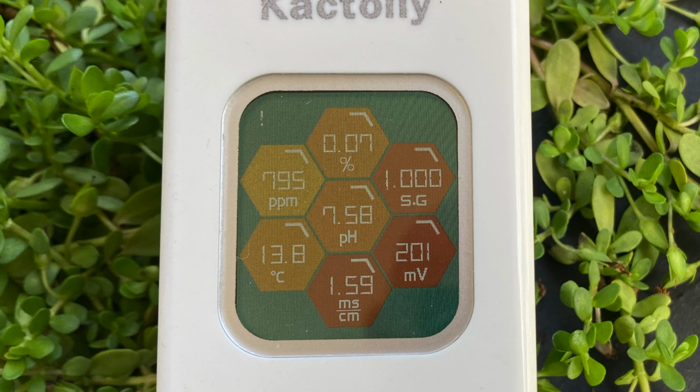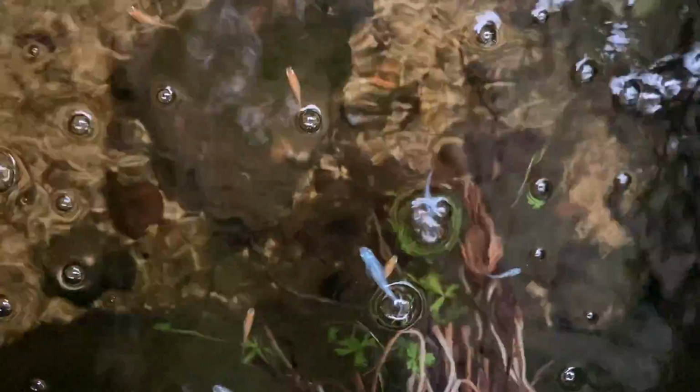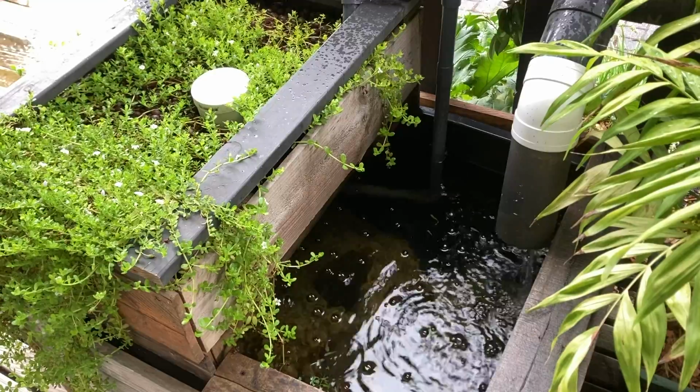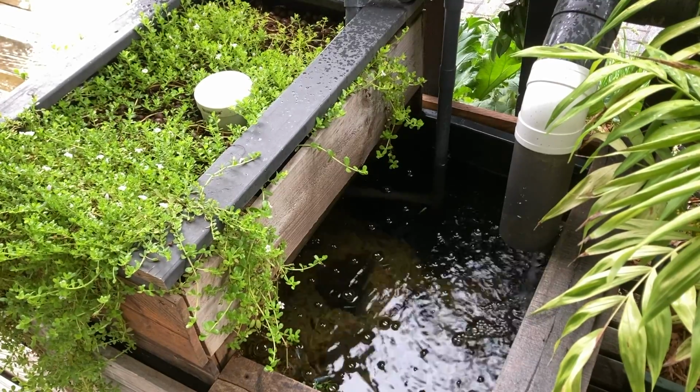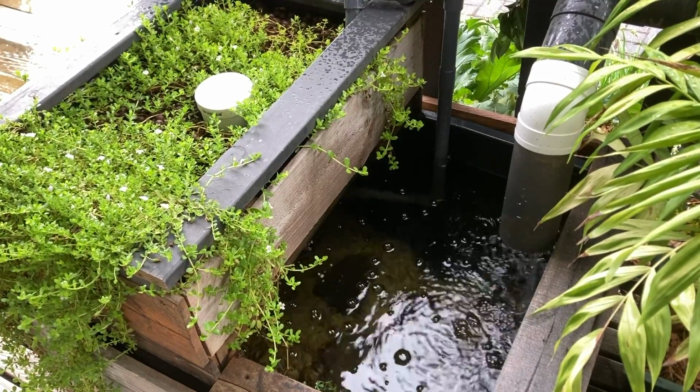The pH is about the same, the TDS is way higher, and the ORP, or oxidation reduction potential, is much lower. The temperature and the pH are both fine. I have no issues with them, but the TDS is pretty high compared to the last pond. Remember, that's kind of the guide to the purity of the water. The ORP is much lower, which measures the ability to oxidize waste inside the pond. I think oxidize is a fancy way of saying process. So the higher the ORP reading, the quicker the pond can process waste like poo and uneaten food. That's my basic understanding, and I might be a little bit wrong.